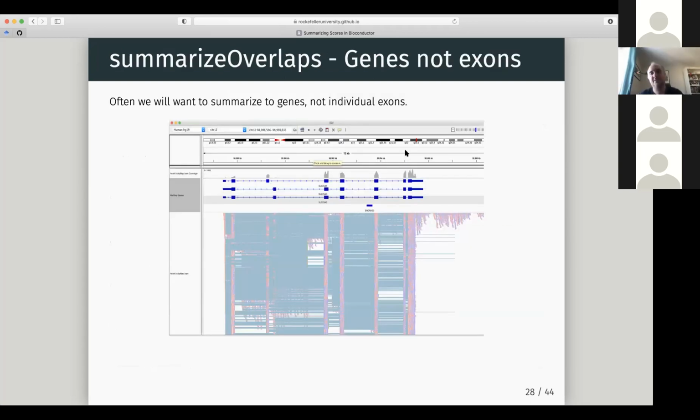It has options to allow you to include these things if you needed to, but by default, it's going to do a great job. Like I said, often we don't care about this complexity of exons overlapping, maybe alternate exons here and subtle differences. We just care about, does a read land somewhere within the exons on this gene and only in that gene, so that I can trust that it's to do with that gene's expression overall. Maybe you're not so interested in whether this exon's expressed differently to this exon, yet.